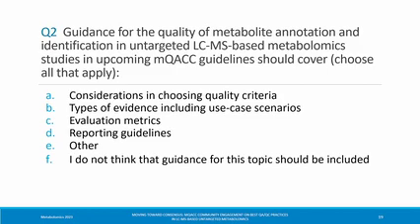That's a great question. Rick? It's a great question. It's difficult. It is annotation. It's not identification, even, because it's machine learning within there. But there's discussion at the moment about what sort of level of confidence you have in those as well. So it's something that's been discussed within the Metabolomics Society task group on metabolite identification.